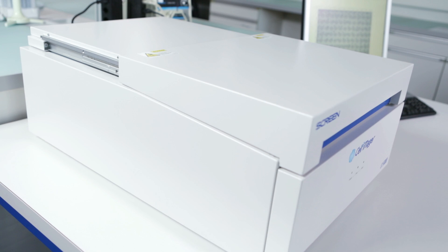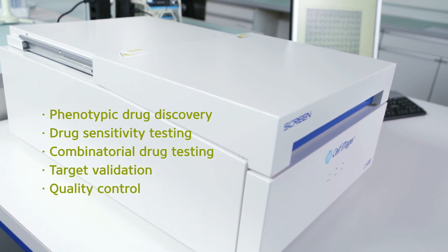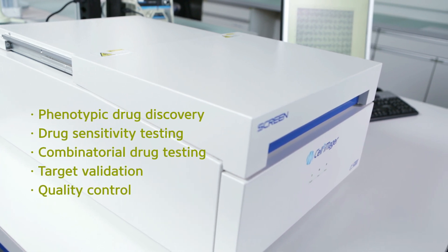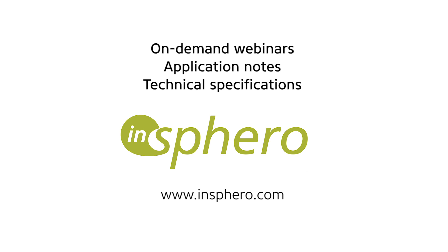See how the Cell 3 Imager can help you streamline phenotypic drug discovery, drug sensitivity testing, target discovery, and more. Learn more at insphero.com.